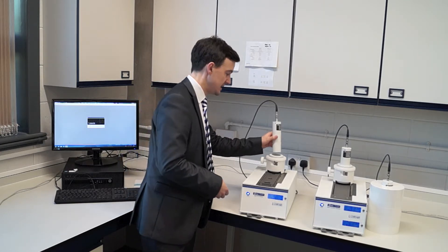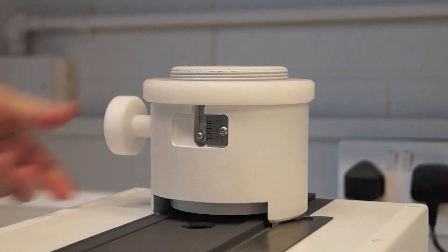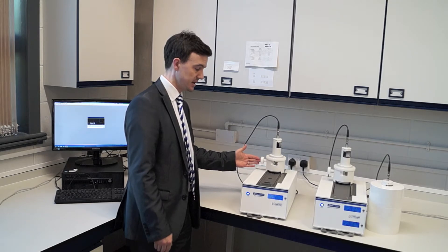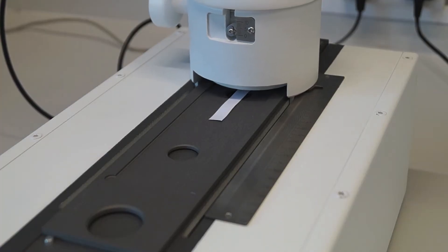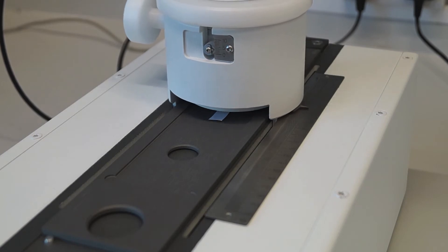The detector sits into a height-adjustable lead collimator. To adjust the height you simply turn the wheel, and to lock it into place you simply turn the wheel on the side here. The collimator is driven by a very smooth motor, which means the detector is going to go back and forth collecting data across your radio TLC strip.